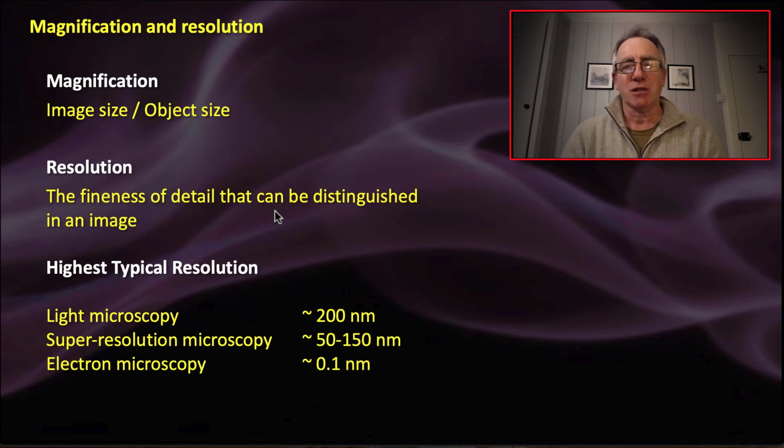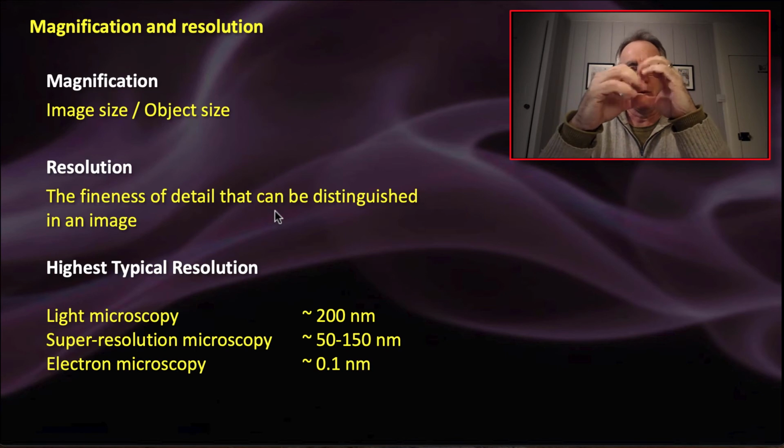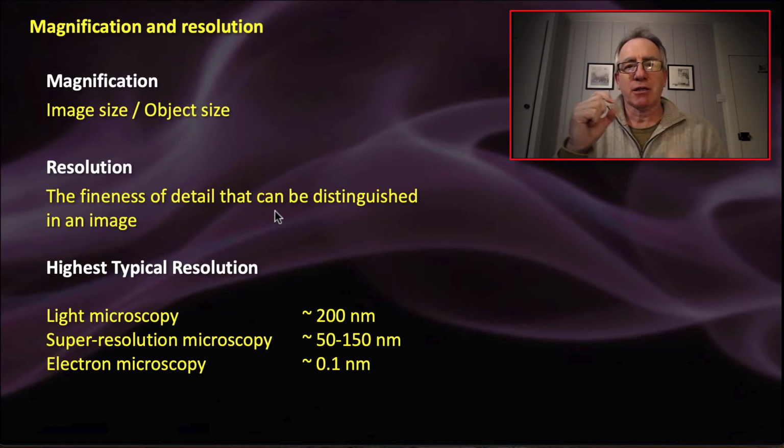Here, we'll do this as a thought exercise. Two incredibly small objects, maybe they're organelles inside of a cell, at low resolution will appear as one big blurry object. At high resolution will appear as two distinct dots. So our goal in advanced bioimaging is resolving power.